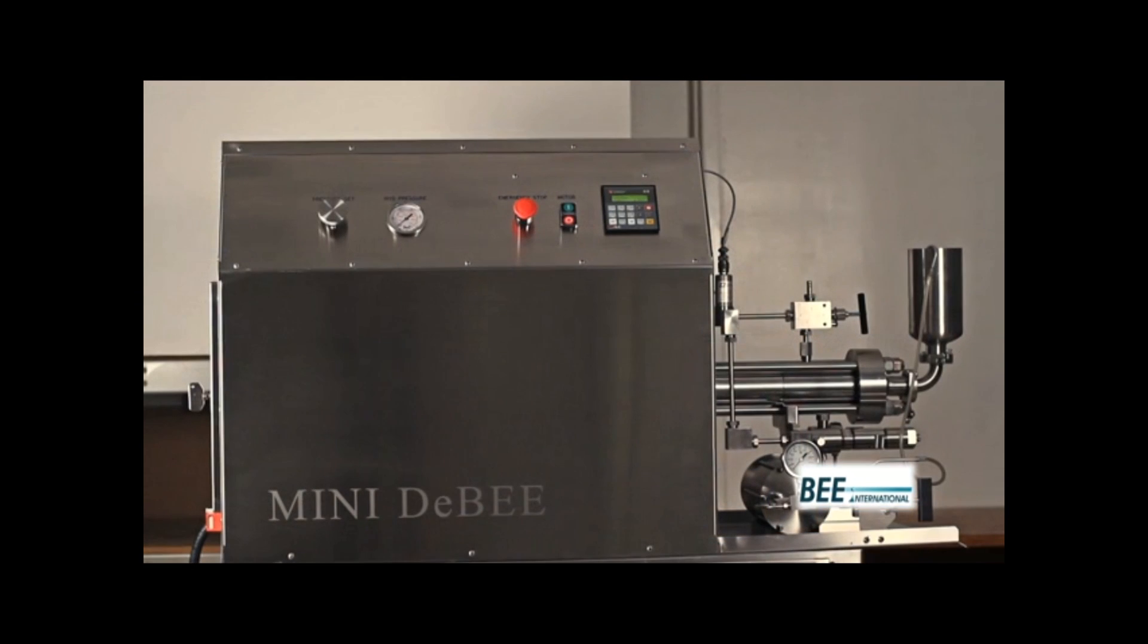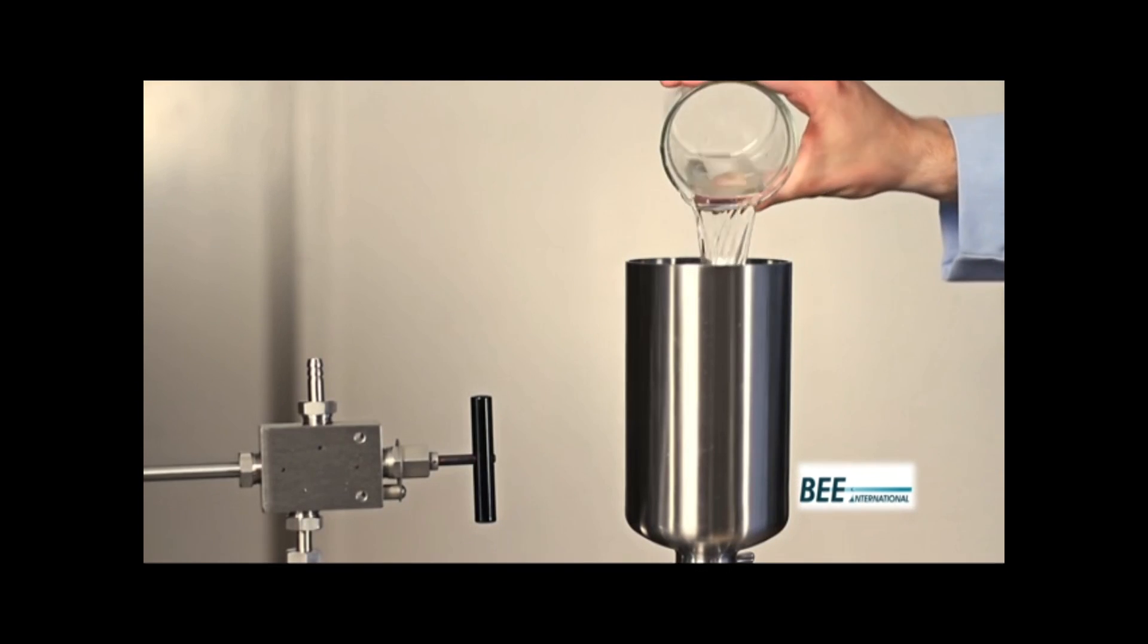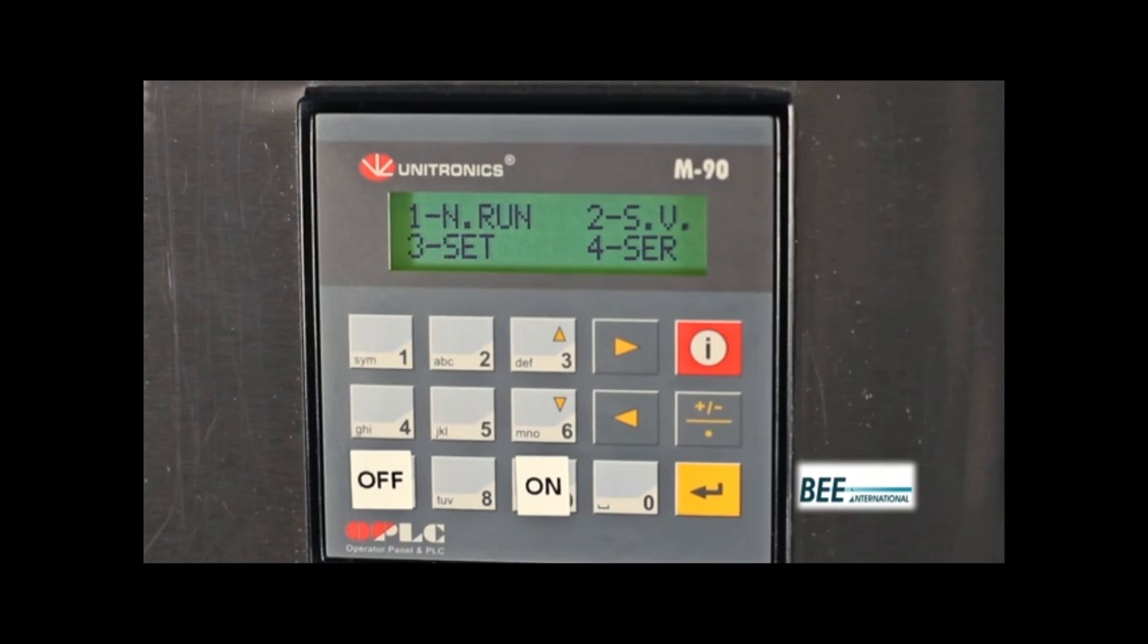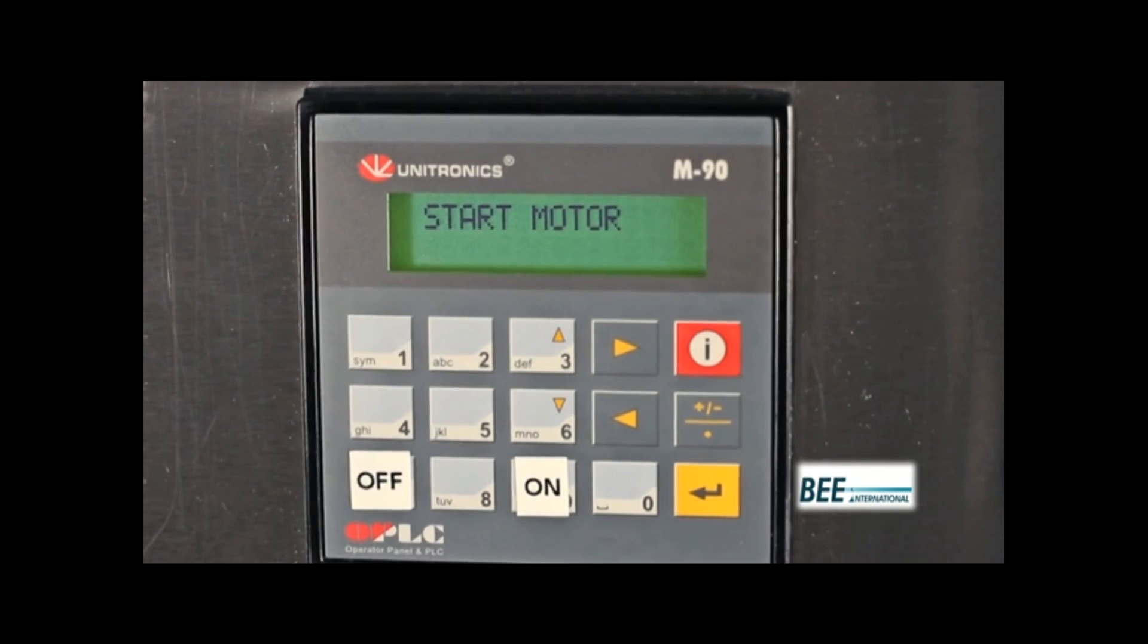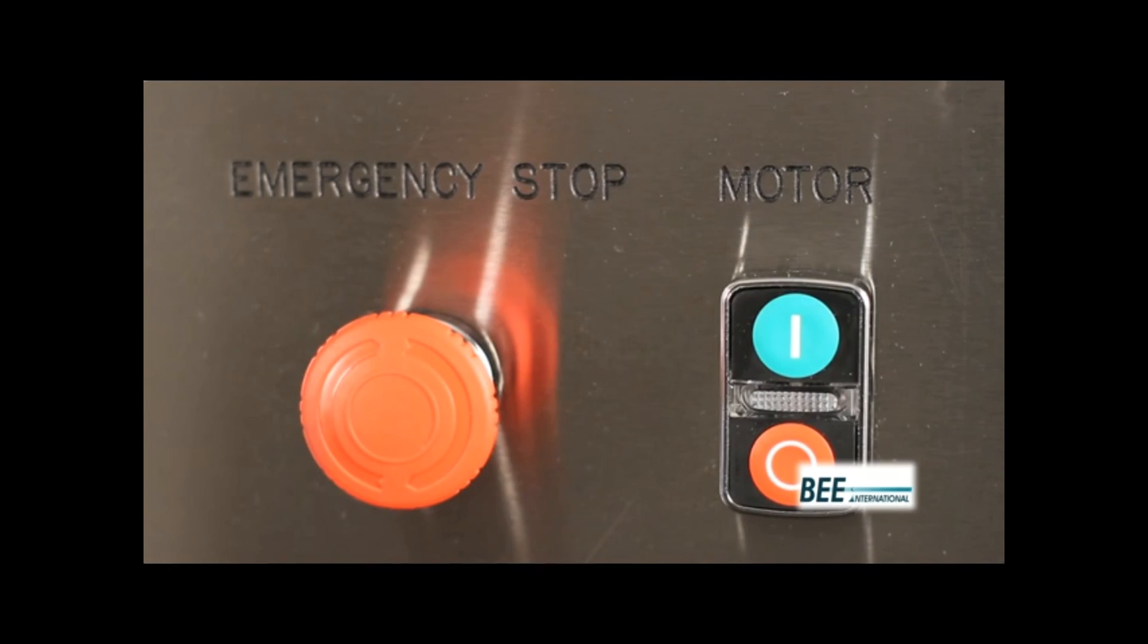To operate the MiniDB, first ensure the inlet reservoir is filled with product and the system is primed. Press 1 on the PLC to enable normal run mode. Turn the pressure set dial counter-clockwise for the lowest pressure setting. Then turn the motor button on.